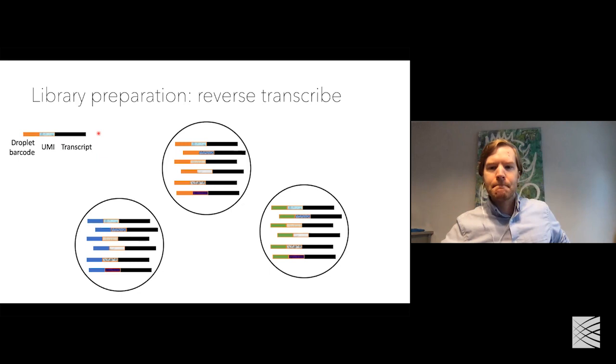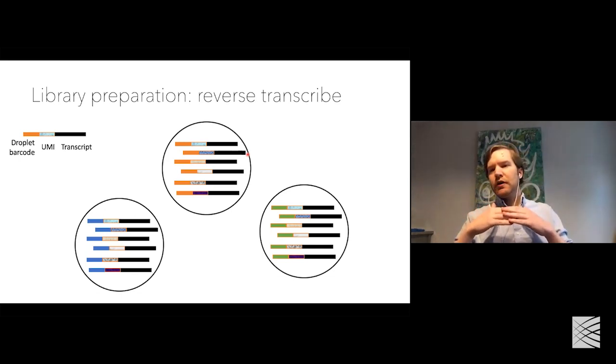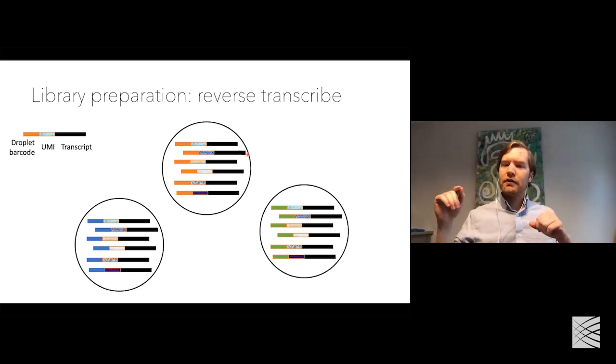Sorry, the second question was: at which step or steps do you lose the most molecules per cell, since the data is so sparse? Interesting, very good question. It seems the step where you lose the most molecules is the cDNA step. Somewhere between capturing these mRNAs by hybridizing poly A tails to poly T capture oligos and actually creating the full-length cDNA, we lose some molecules.